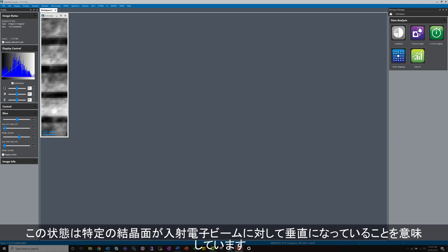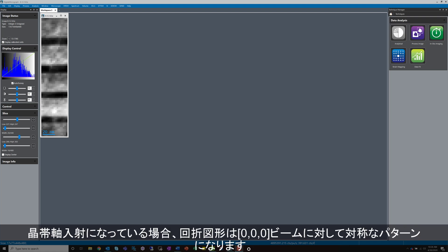This just means that a certain crystallographic plane in the crystal is perpendicular to the beam direction. When the sample is set up this way, the diffraction pattern should be symmetric around the OOO beam.